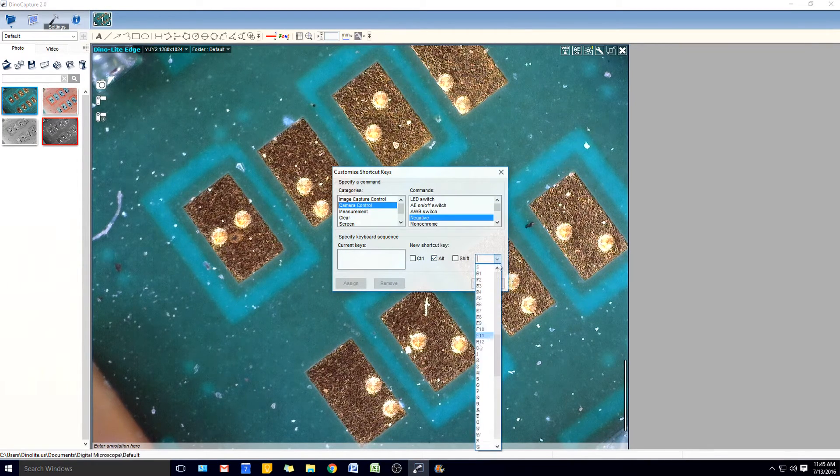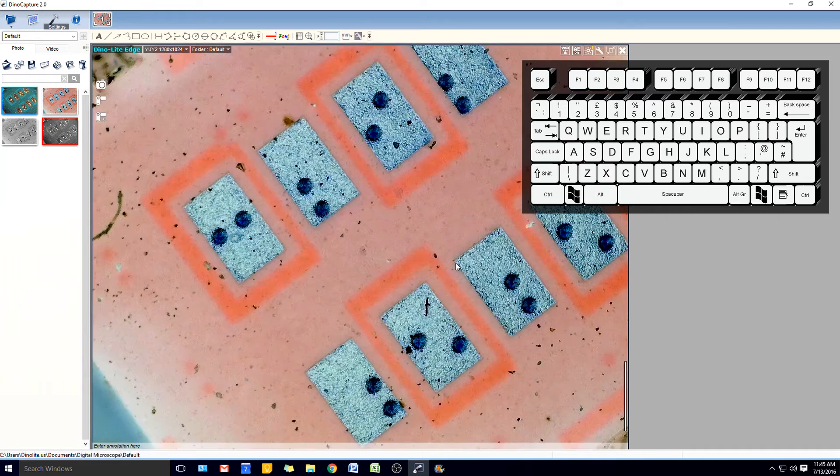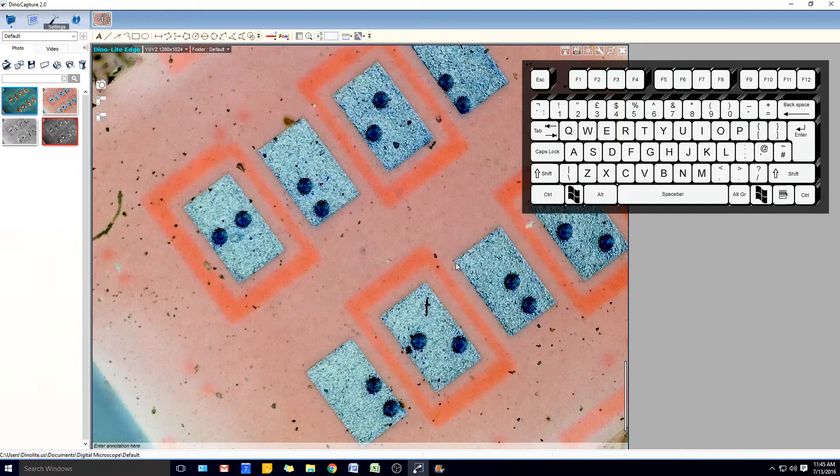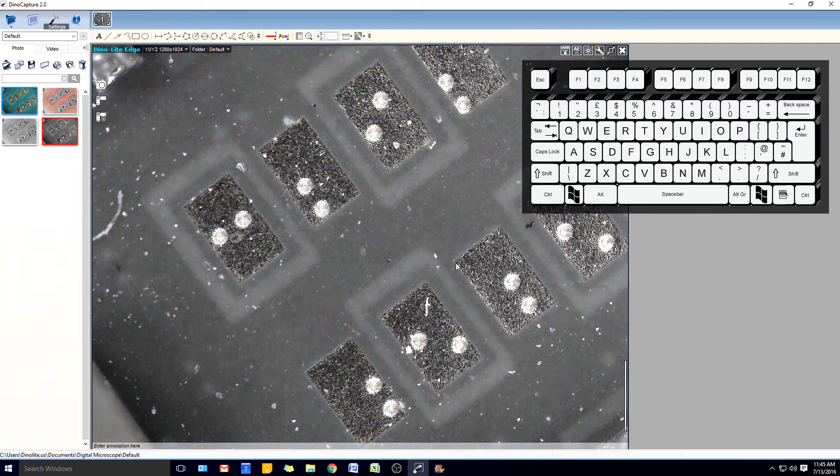Now instead, simply assign a key or combination of keys such as Alt and N, and switching is done each time the Alt and N keys are pressed simultaneously.